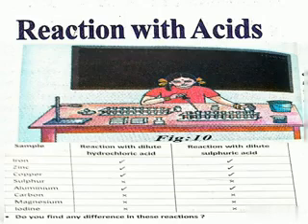In figure 10 we can observe some test tubes. In the test tubes we first take the samples given in table 8, and then add 5 ml of dilute hydrochloric acid to each test tube with a dropper.